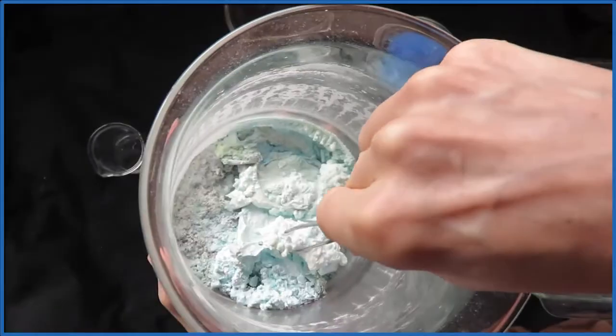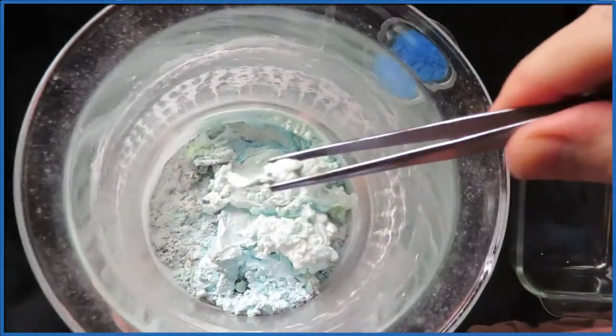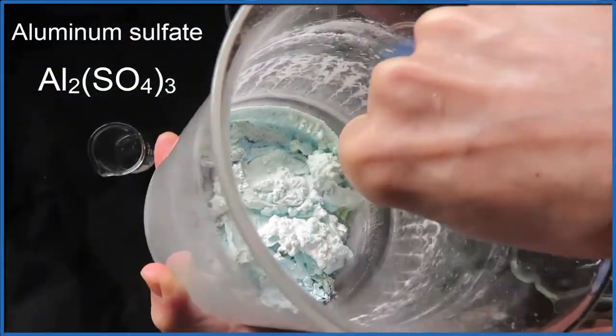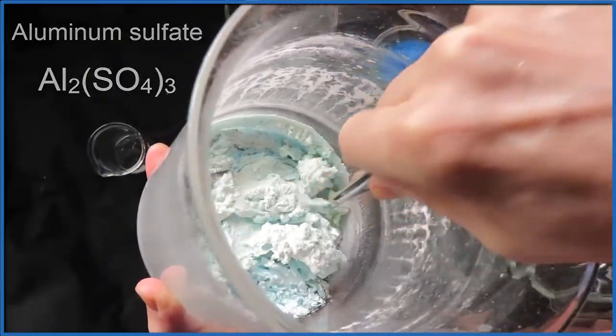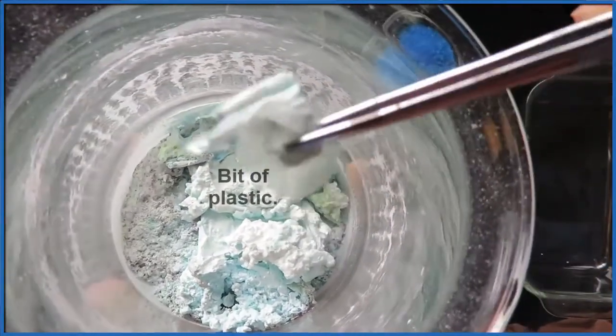That white substance at the bottom of the beaker, that's the aluminum sulfate. It becomes a solid once the water's gone. So that's solid aluminum sulfate, all the white on the top.